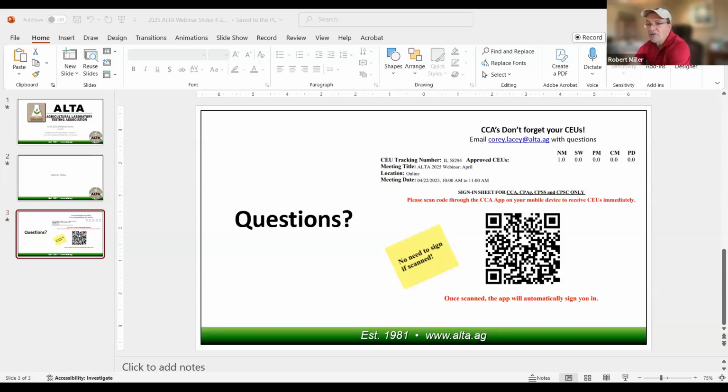And I got to tell you, I was worried that we were going to have to grind our samples down to 0.25 millimeter minus, which again is added sample cost. But it does appear, looking at this data set of these two soils, that the sweet spot's 0.5 millimeters and 500 milligrams, which is really a very achievable thing to do.